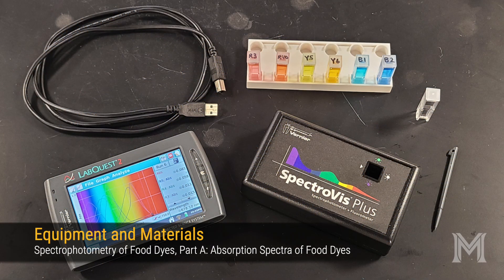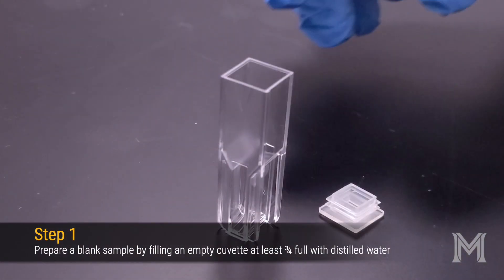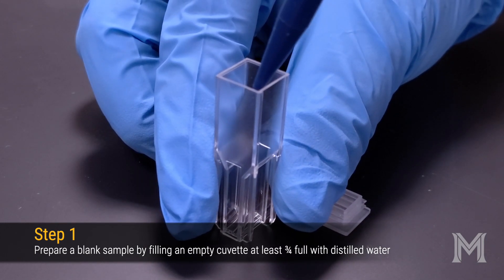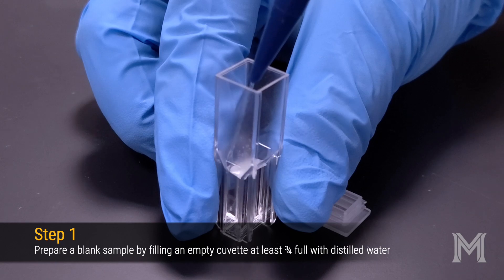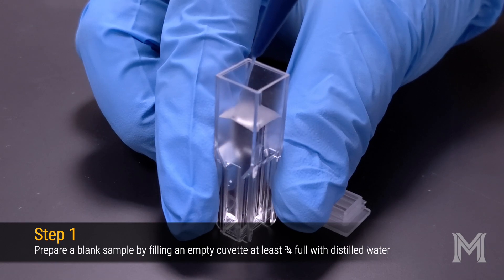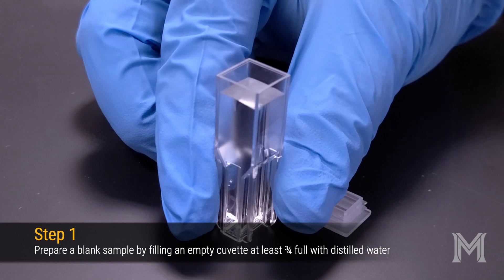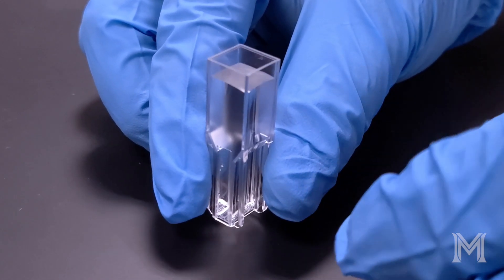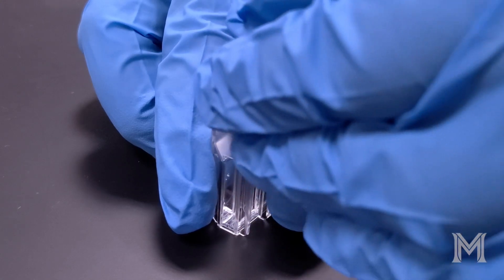Here are some of the materials that we'll make use of in part A of this experiment. First, we'll take an empty polystyrene cuvette and fill it at least three quarters full with distilled water. This will function as a blank or reference sample in our experiment. If you have a cuvette cap available, go ahead and cap the cuvette to avoid spilling it during the experiment.